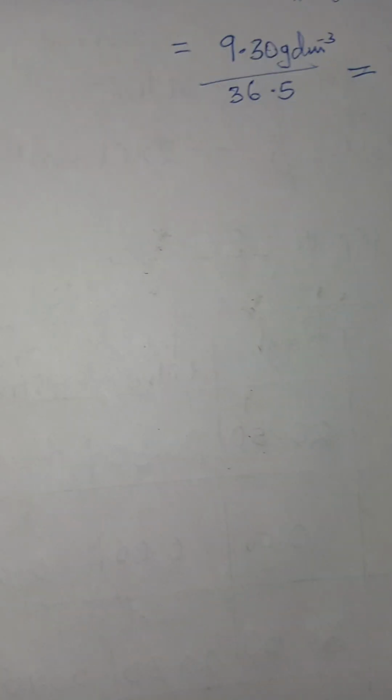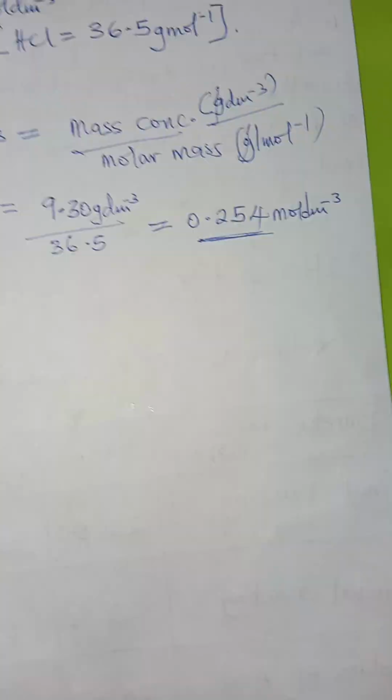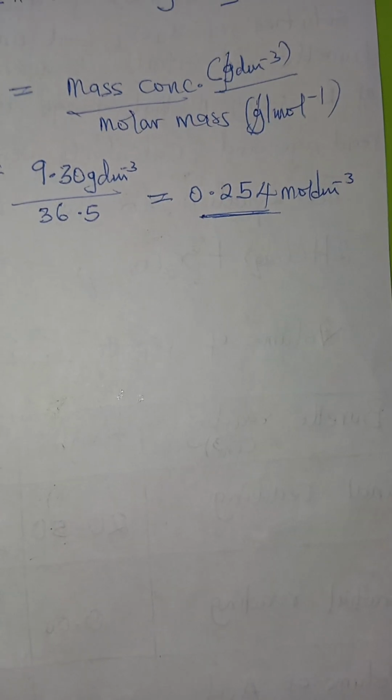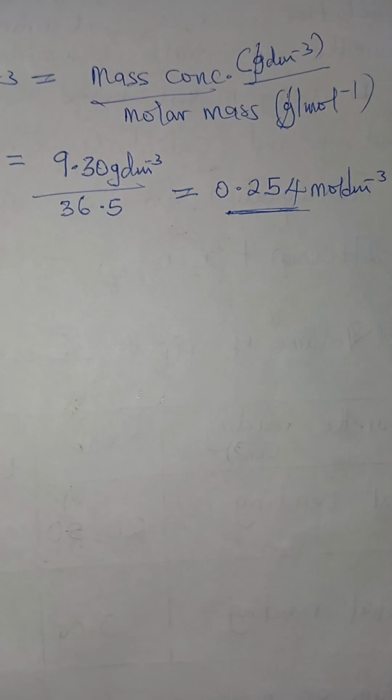Is that okay? Now, having known, you can see that the molarity is in 3 significant figures. Please take note that molarity should always be in 3 significant figures. The same thing as molar mass concentration. It should also be to 3 significant what? Figures.